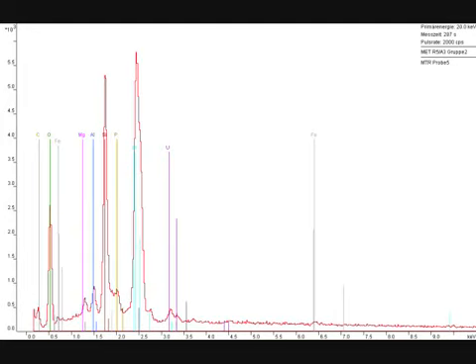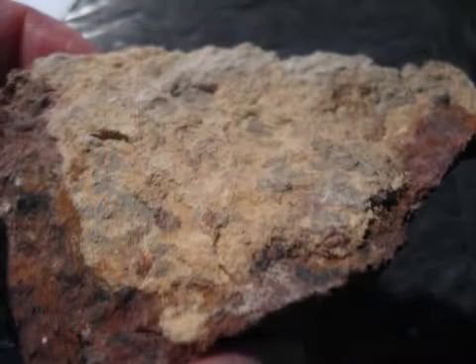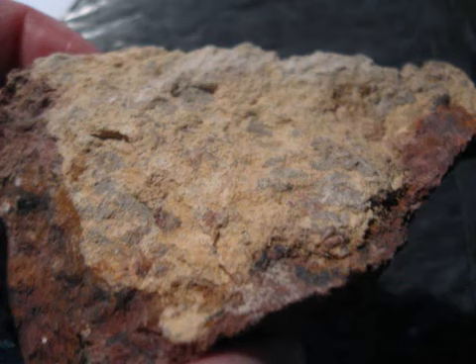Oh, it is important to know, by the way, that any elements that are below carbon in the periodic table cannot be analyzed with this method. Same if an element is present with less than 0.2% in total weight. So yeah, this mineral sample contains bismuth and uranium and silicon and a few others, as we just saw.